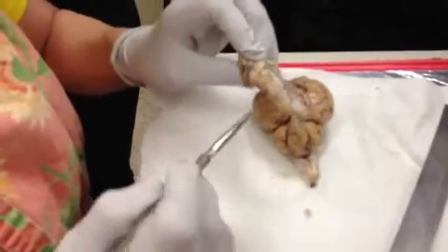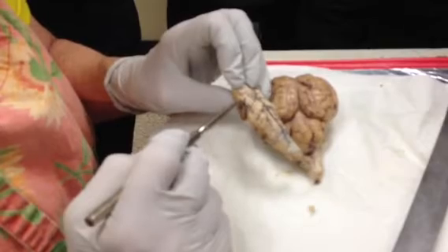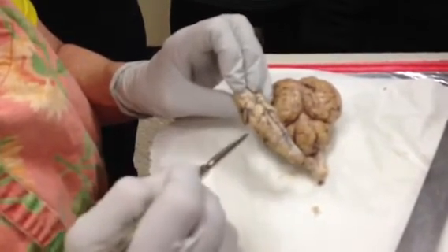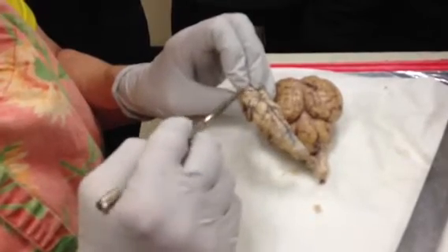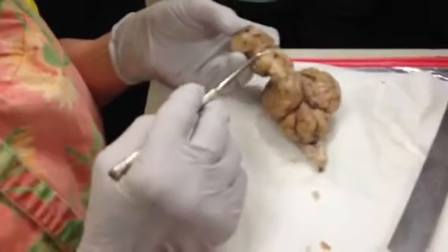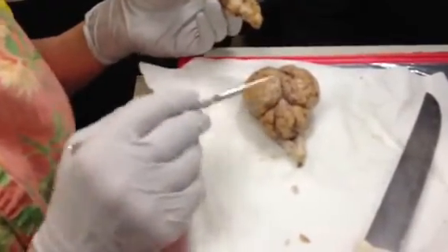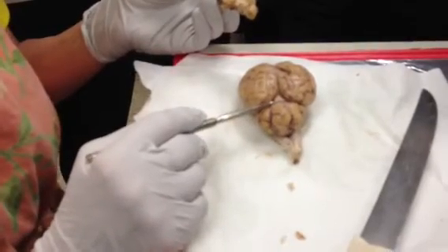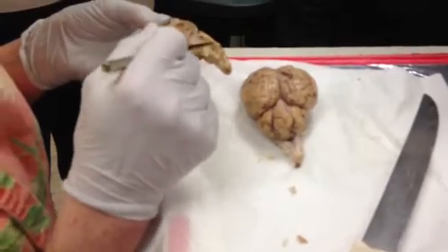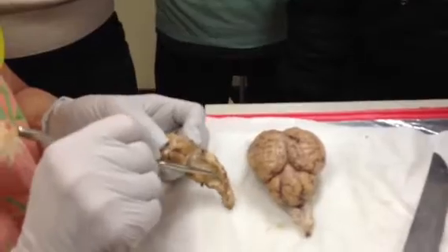My cerebral peduncles would be lateral to oculomotor on the opposite side. Do we have that aspect? On one side is cerebral, ventral. On the dorsal side would be cerebellar, because where's your cerebellum? On the dorsal side. Okay? Then you can see a very large fourth ventricle. And you'll also be able to see a central canal.